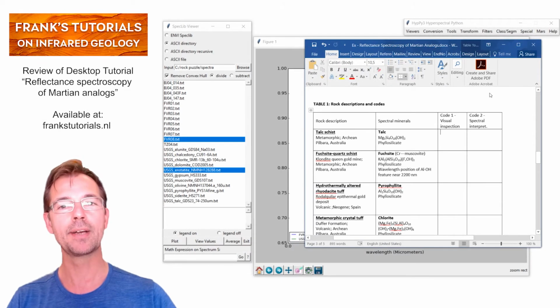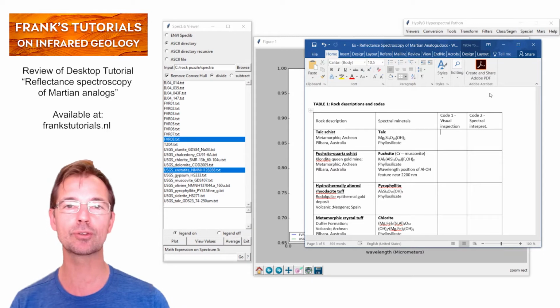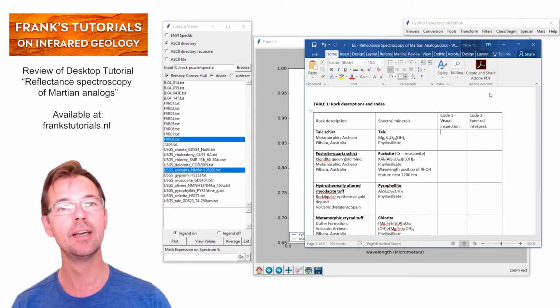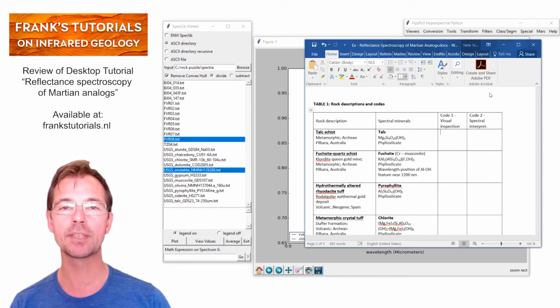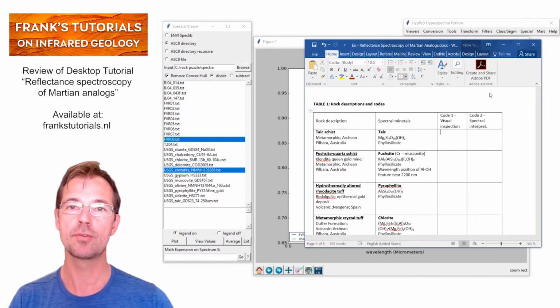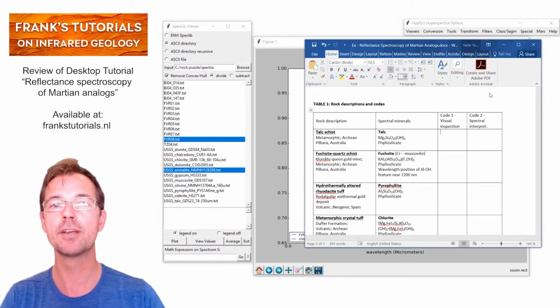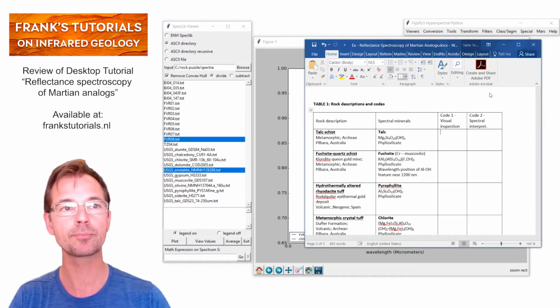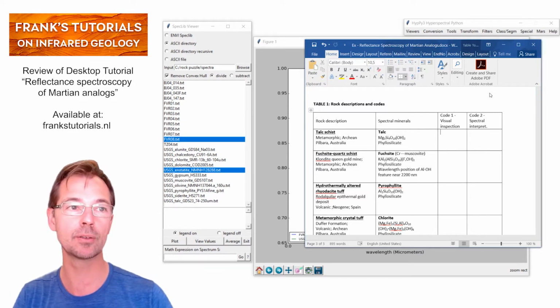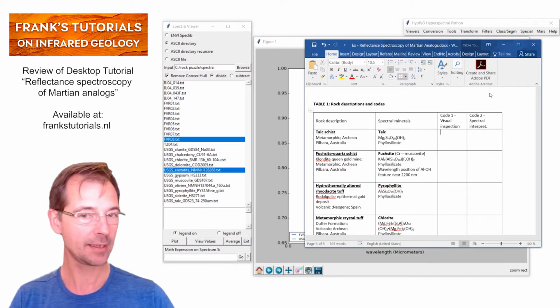Hello, I'm Frank. In this video I will review the exercise Reflectance Spectroscopy of Martian Analogs. You can find this exercise on my website frankstutorials.nl. The exercise is a puzzle where you have to match rock samples to rock descriptions by interpreting the mineralogy from infrared reflectance spectra. So it's a great exercise to learn about spectral interpretation of minerals. Right, let's start.